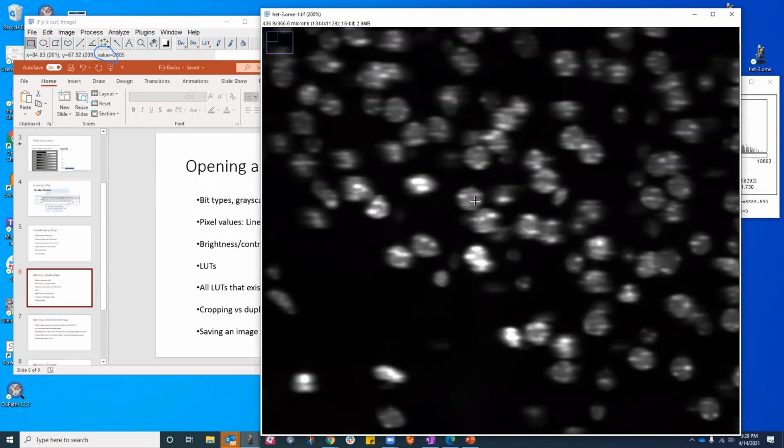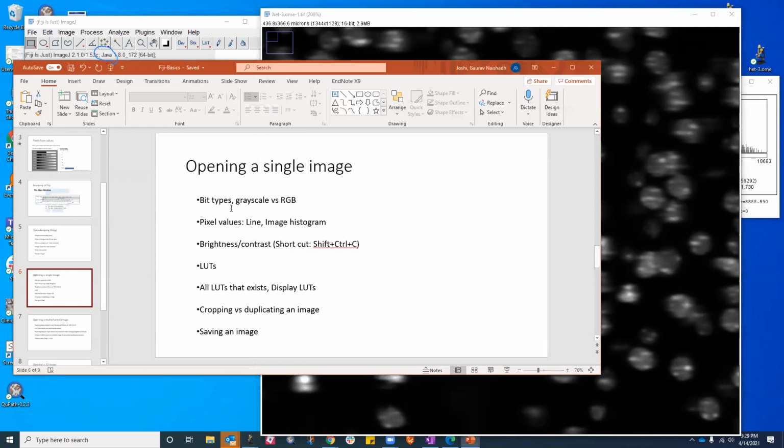And the question you raise is very important, because that's part of data reproducibility, right? Because if you want to reproduce the same ROI from a big image that you have, how can you be sure that you're looking at the same ROI every time? So I'll talk about the ROI and how to save those things.